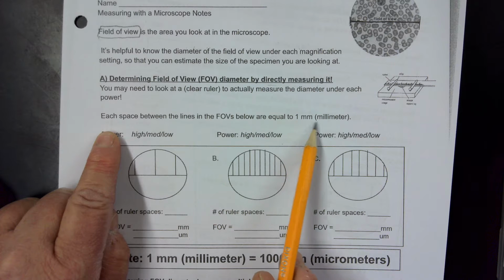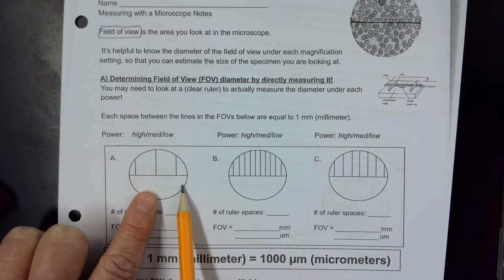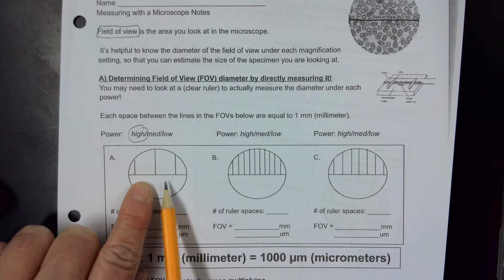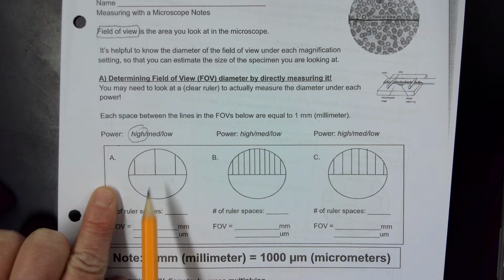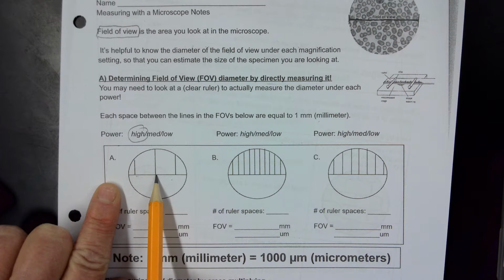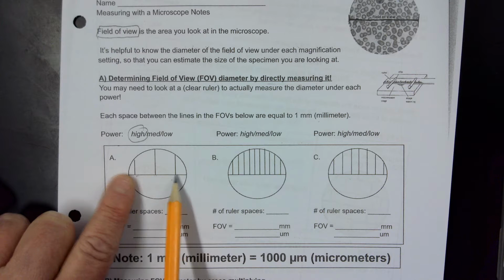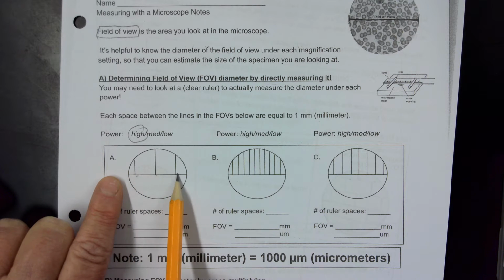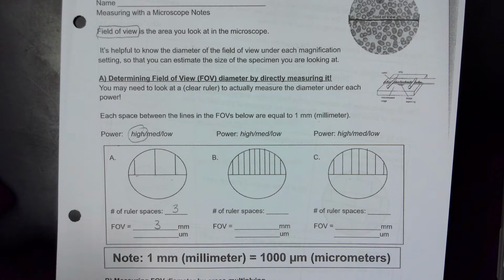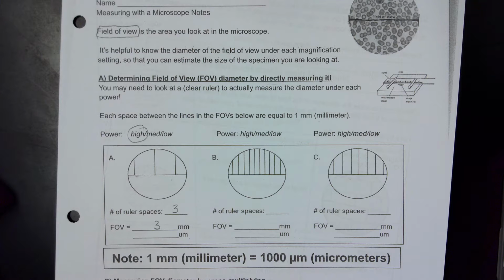So we're going to assume that the lines in these fields of view are each equal to 1 millimeter. If we look at these three, if we had to guess, this is probably the high power because we see only a couple markings here. So the distance from here to here is 1 millimeter, so 1 millimeter, 2 millimeters. And if we patch these two pieces together, this has about 3 ruler spaces, so this is about 3 millimeters of a field of view.